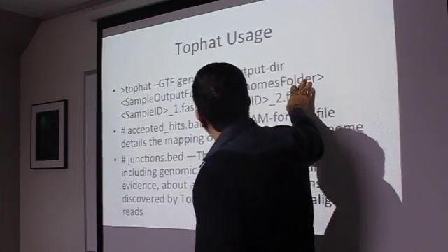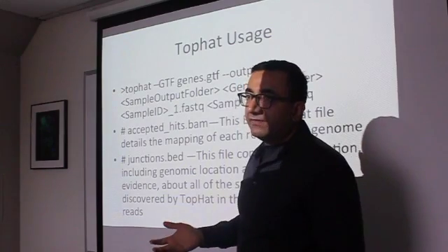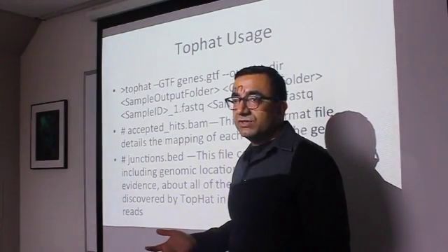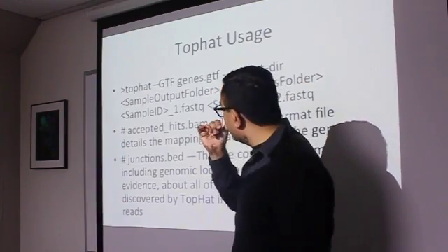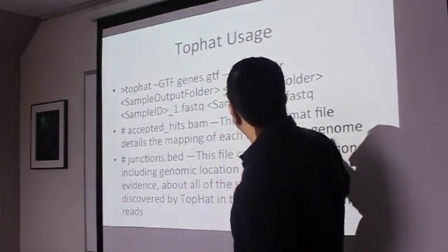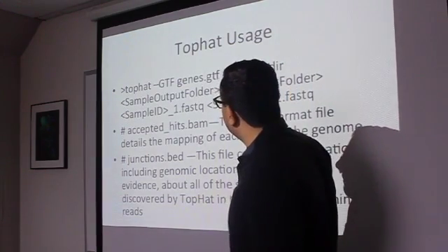This is where your genome file is located. Your genome file will be your reference FASTA file, the human genome reference. So you give the name of the folder. You don't have to specify the file. I think it will just search within that folder for the reference FASTA file.